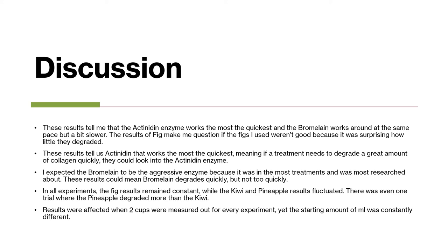These results indicate that actinidin works the most and the quickest, meaning if a treatment needs to degrade a large amount of collagen quickly, they could look into the actinidin enzyme. I expected bromelain to be the most aggressive because it appears in the most treatments and is the most researched. These results suggest that bromelain degrades at just the right pace but not the quickest. In all experiments, the fig results remained constant while kiwi and pineapple fluctuated, and there was even one trial where pineapple degraded more than kiwi. Results were also affected by slight variations in the starting amount of gelatin measured.